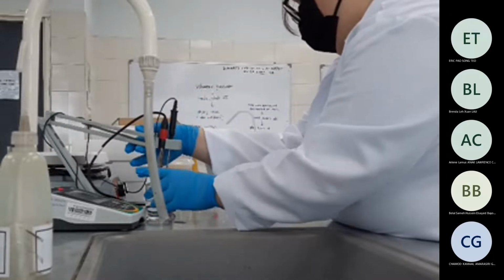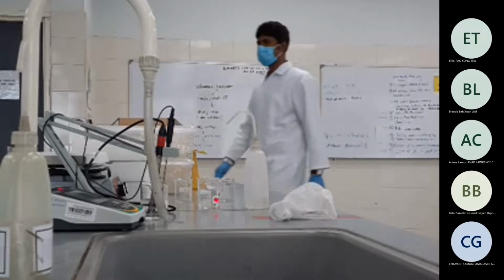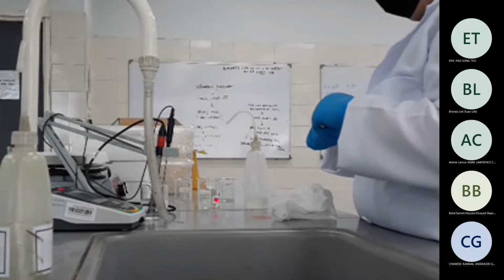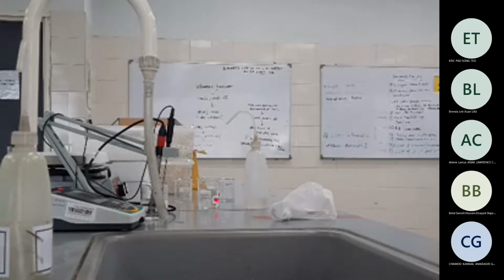Oh, you have to close it fully. If you take water, just close it fully, otherwise it will be leaking. Be careful, don't come here, it is slippery.